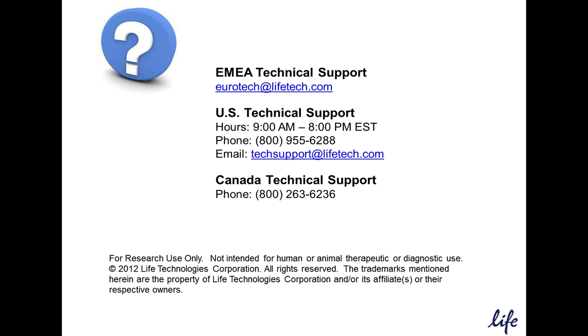Let me see. There's a question about using a bright sample for a compensation control. So, for example, with a CD56, which is a very dim expressing marker, it's not very good to use those cells because your compensation will probably be miscalculated. It'll be undercompensated, and you, in fact, want to use a brighter sample in this case.